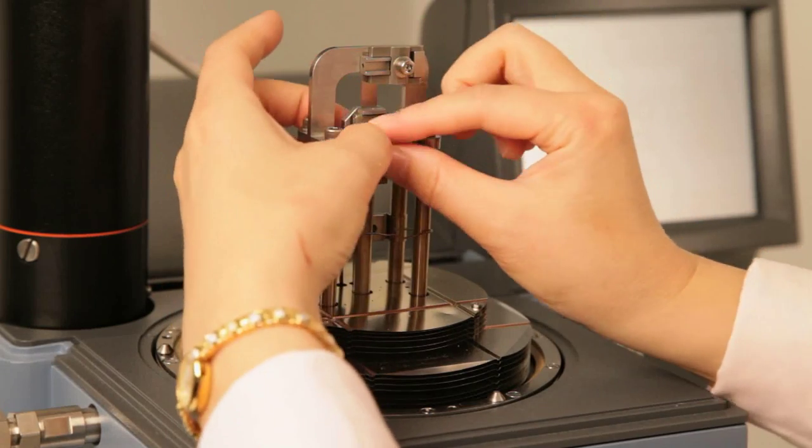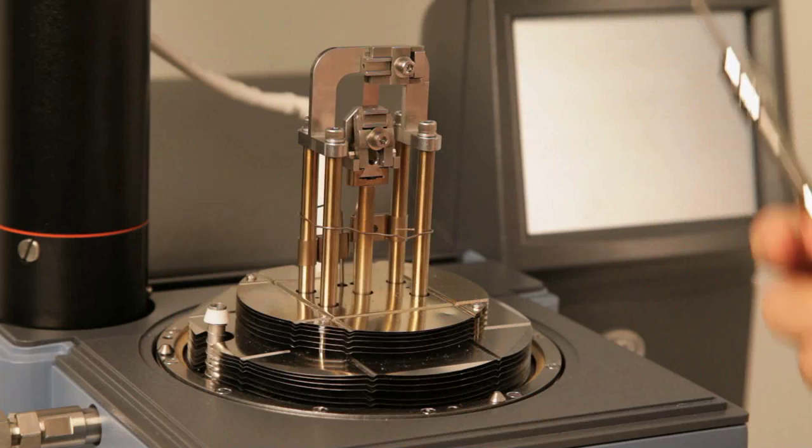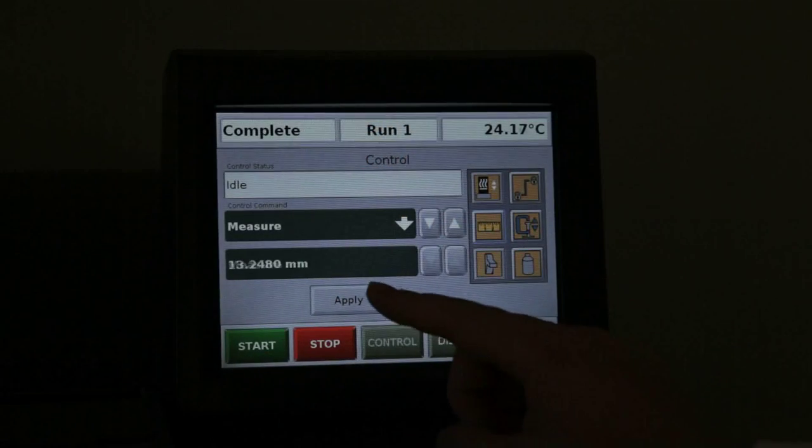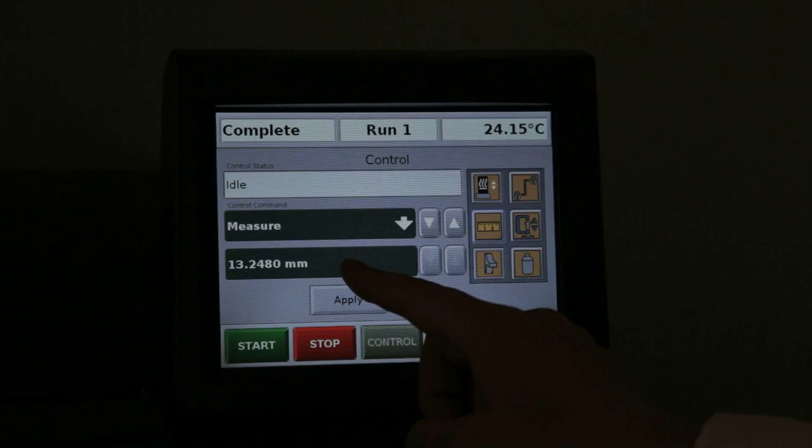Use the torque wrench with the range of 2 to 4 inch pound to tighten the screws. Click on Measure from the instrument touch screen. Record the length of the steel shim.